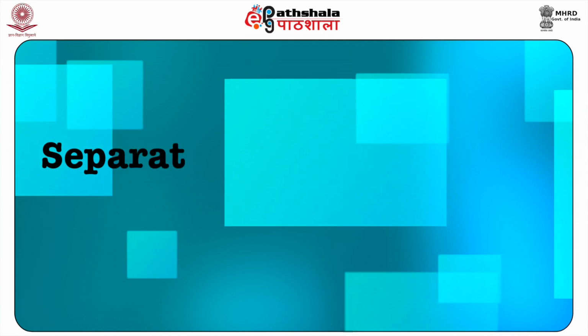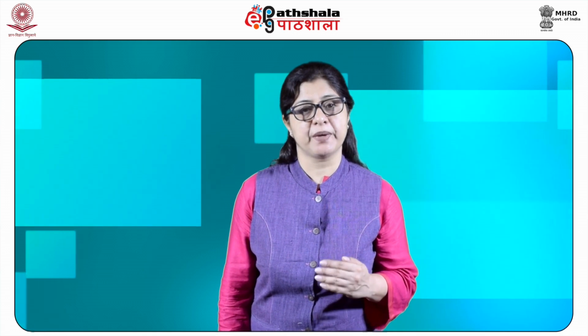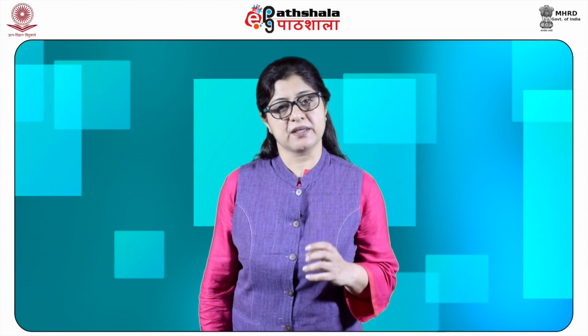Separation of lanthanides. During the Second World War, the separation of fission products presented a major problem to the analytical chemist, especially the mixture of lanthanides, Sm, Eu, Dy, cerium, Pr and the other transition metals, as well as the mixtures of cesium and rubidium, strontium and barium, and zirconium and niobium in the tracer amounts. To separate these, synthetic resins were employed in combination with the technique of chromatographic elution.